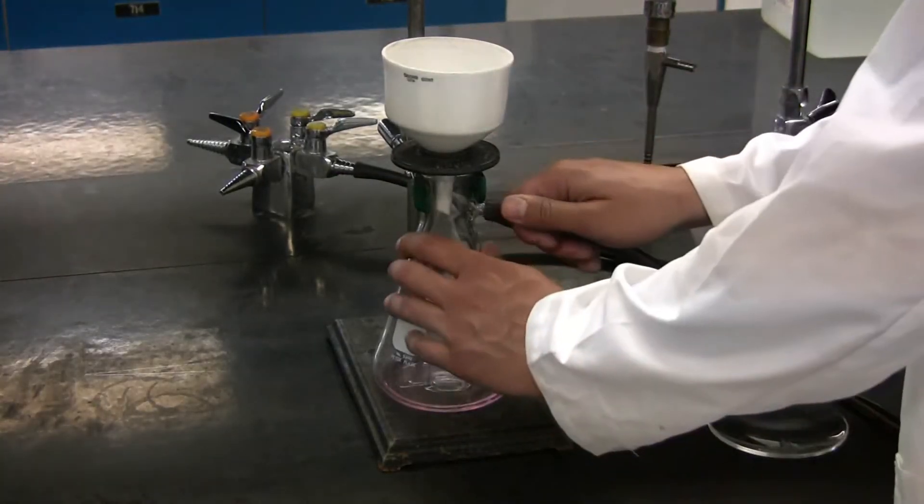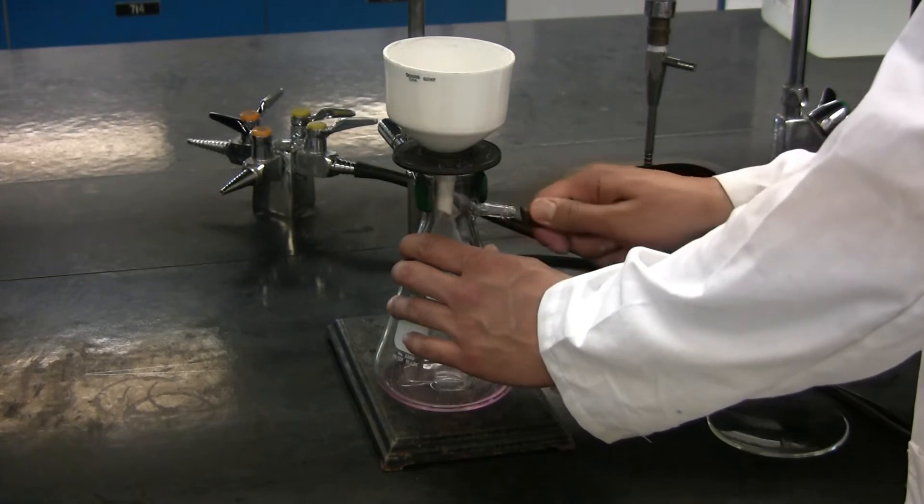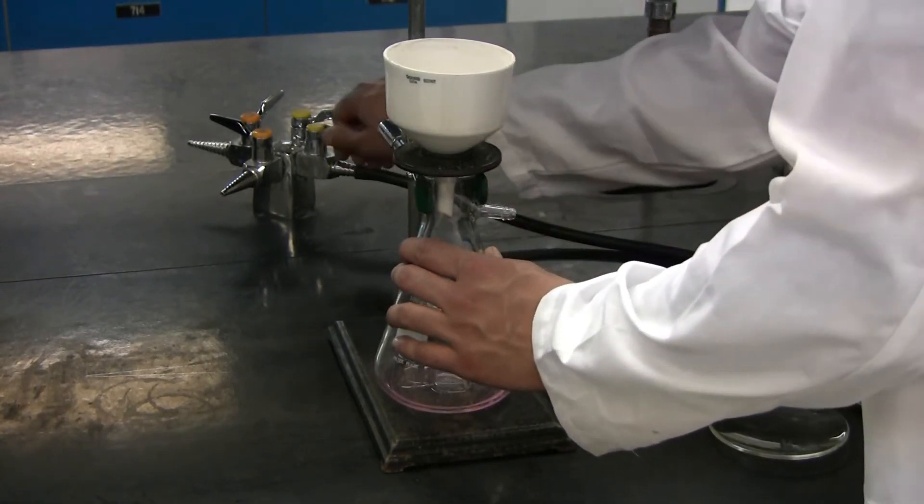Once fully dry, remove the vacuum valve from the Erlenmeyer flask and then turn off the vacuum.